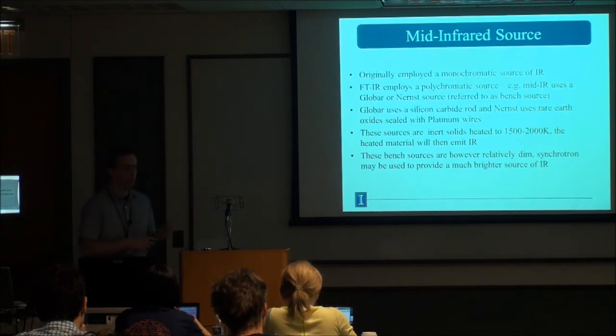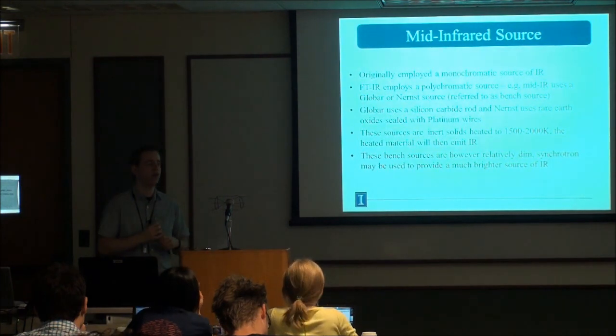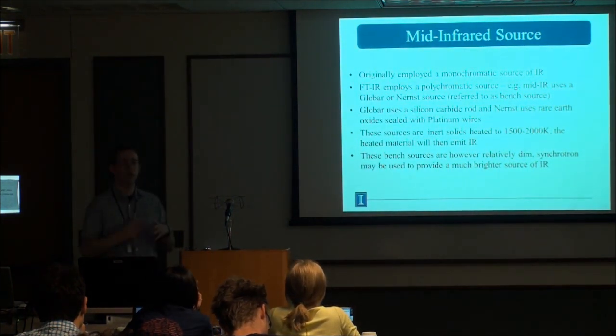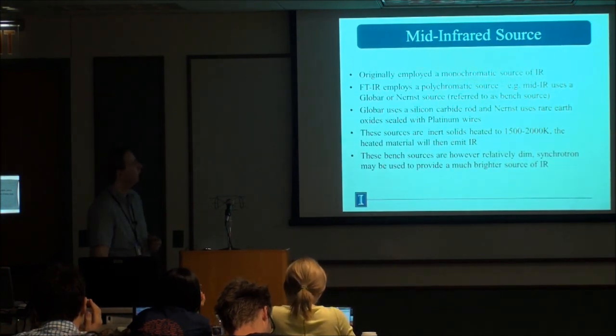Or what I haven't actually put on today is there's been a lot of work on quantum cascade lasers, which actually need to be scanned, but can give a very, very bright source of infrared. And they're just coming onto the market now.